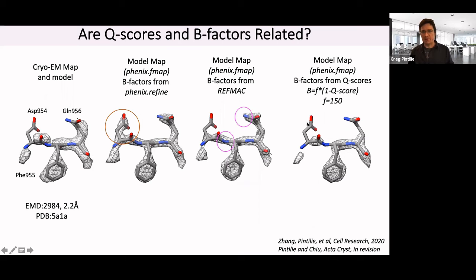So this is all smeared out. And then this nitrogen atom is not resolved, whereas the oxygen is a little bit better resolved. So as we see here in this case, the oxygen seems to be in a higher density. And actually the modeling here is also sort of in question to some degree. This could sometimes be flipped. So this might not have been modeled, it might not reflect the exact conformation, let's say.